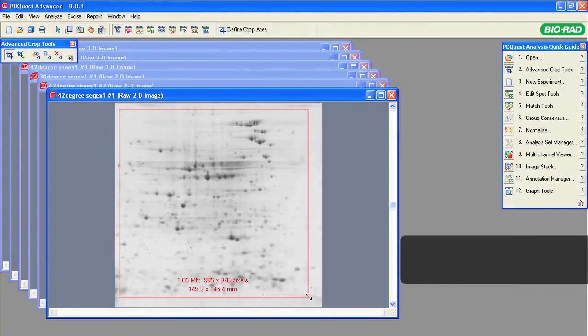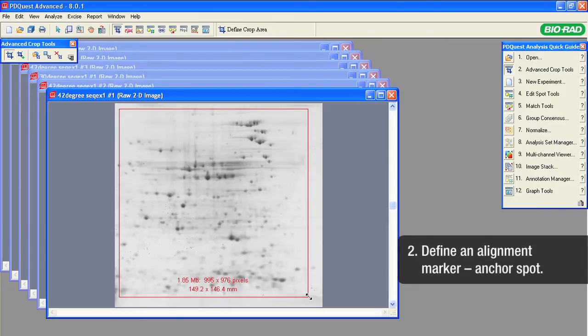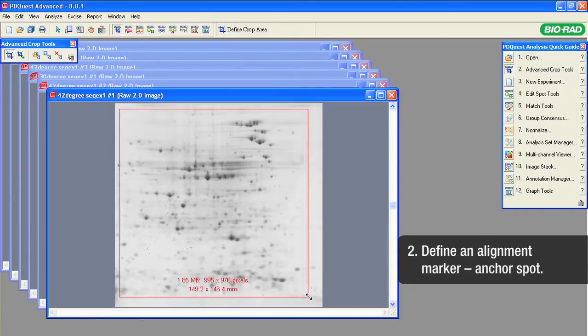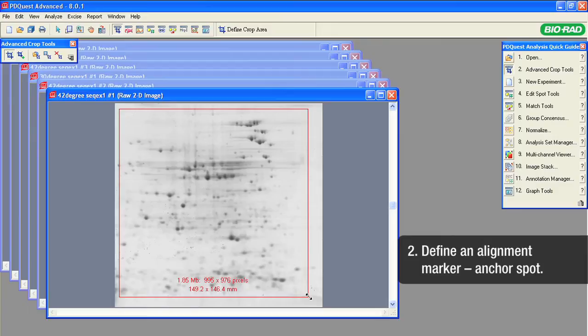The next step is to define an alignment marker, an anchor spot for centering all the cropped images. For the anchor spot, we will select a dark, well-defined spot near the center of the image.